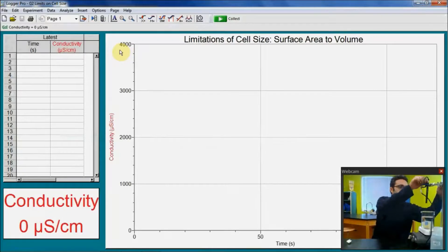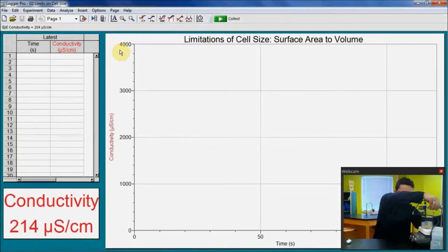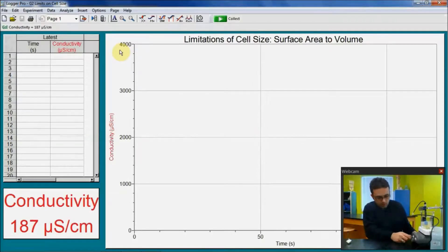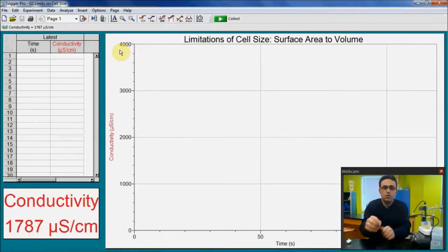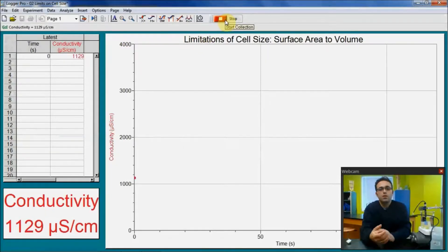While you're submerging the conductivity probe, make sure this little silver piece that collects data is totally submerged in water. And then I start stirring, and then I will start data collection. You can start data collection either by clicking on this collect button or clicking on your space button. It will collect data for two minutes.